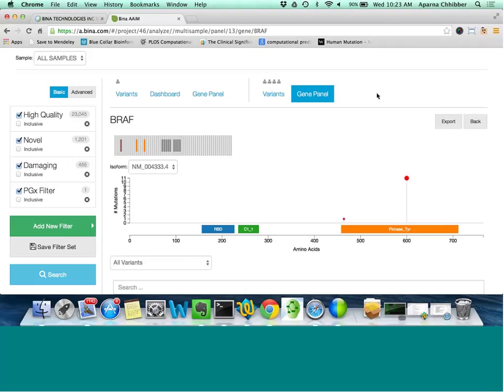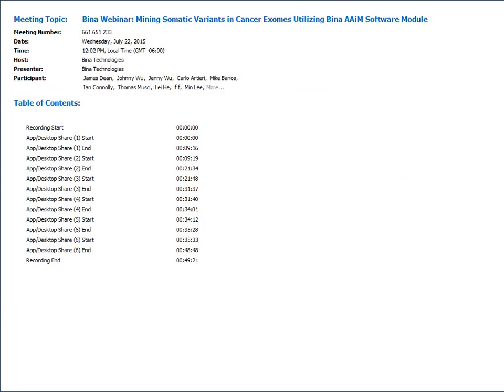There's a question about tumor normal pairs. What you're looking at here, in this example, these were cell lines. This is exome sequencing, so there was no matched normal. If you have matched normal pairs, we'd suggest you use tools specifically designed for looking at tumor normal pairs together. And again, our RAVE software has a great set of tools for doing tumor normal variant calling.